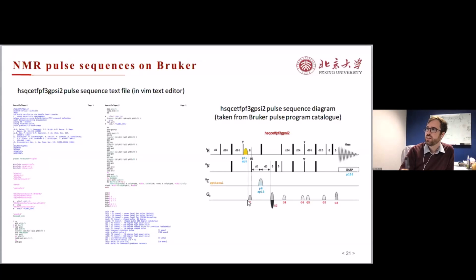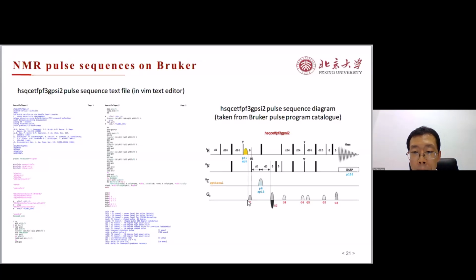Yes. That bridges well into a question from Nahum, saying, hi from Colombia. Just want to say thanks for your presentation, and also had a question about how to calibrate the gradient pulses, which I think you may have covered a little bit right there, where you are looking at the water signal and seeing if the water signal is being well suppressed or not.